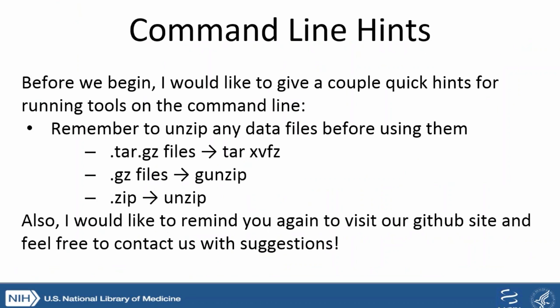So before we begin, also, for some people that might not be used to working on the command line, you're going to want to remember to unzip or tar xvfz any files that you do download before using them. So for files that end in .tar.gz, you'll want to do tar xvfz. For .gz files, you want to gunzip and then the file name. And for .zip files, you want to do unzip and then the file name.